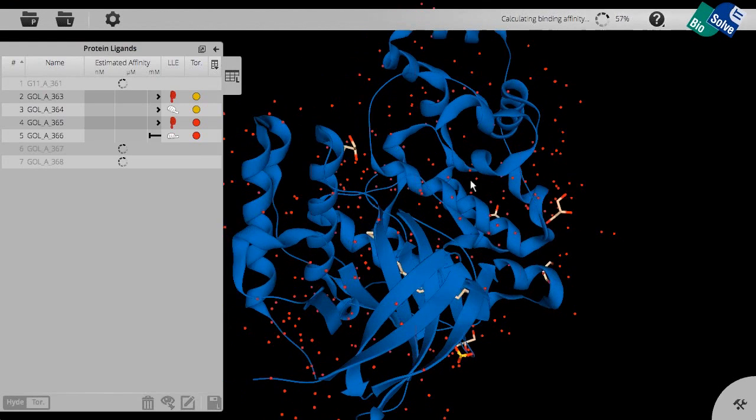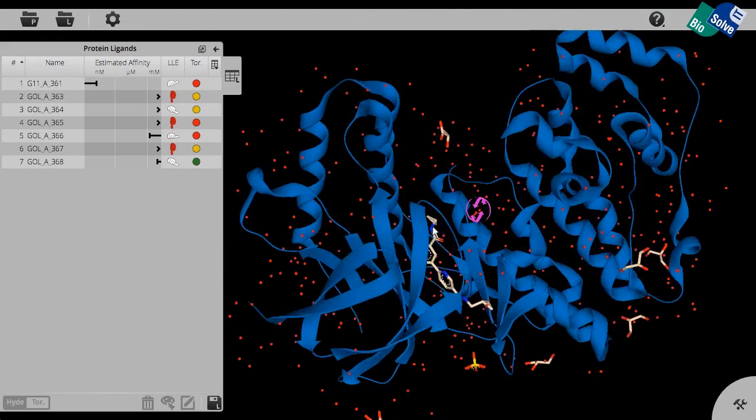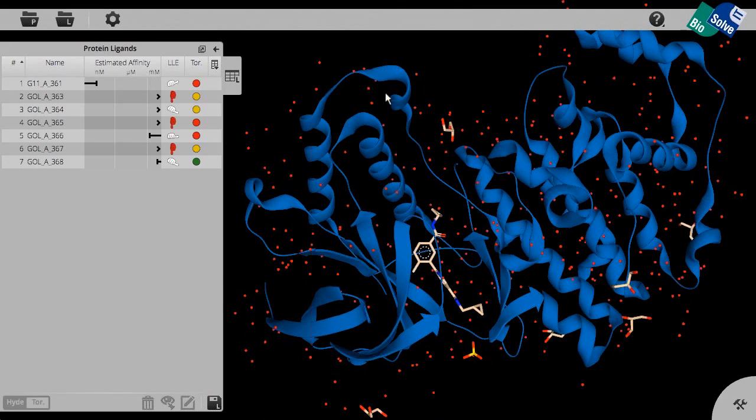When you start the software, you will see this window here, which allows you to either directly download from the PDB website, or you can select a protein complex from your hard drive or from your network. We will look at 3-IPH today, which is a p38 Map Kinase and a so-called magical methyl. So here, when you load the structure, you will see the protein and the ligand in 3D. Those little red dots are all water molecules.